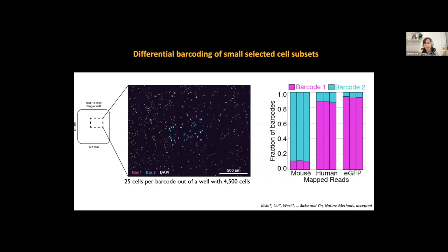That was not bad, but we actually improved this accuracy quite a bit after these first experiments. One of the reasons we discovered there was a barcode mismatch was the background binding of the fluorophores. So with more blocking, we even improved that in future experiments. But this first pilot experiment gave us a lot of confidence that the whole workflow is feasible, and one could actually get to whole transcriptome information, find back where the cells came from, and assign the regions back to the in situ cells as well.